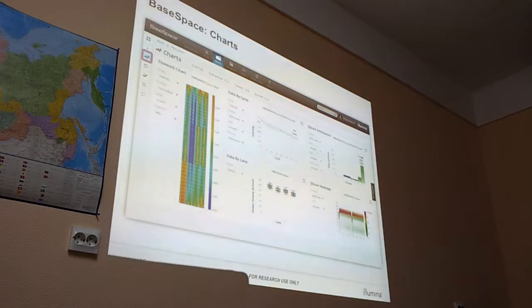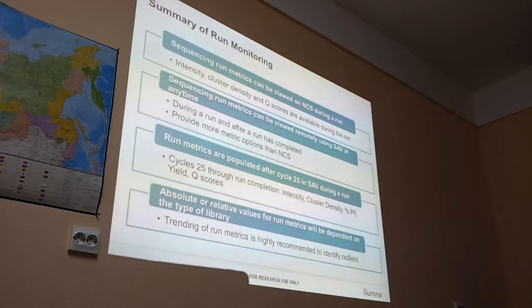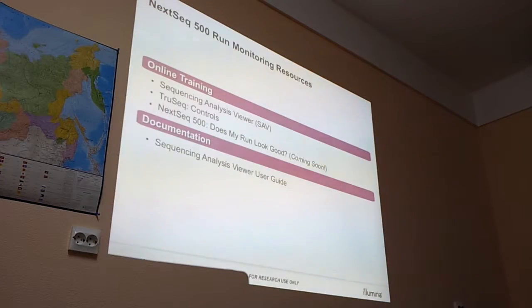Yeah. Or if there is something with the pipetting, so it's better to have at least two values. Summary. Okay. No. Yeah, we can have a look later at the machine.